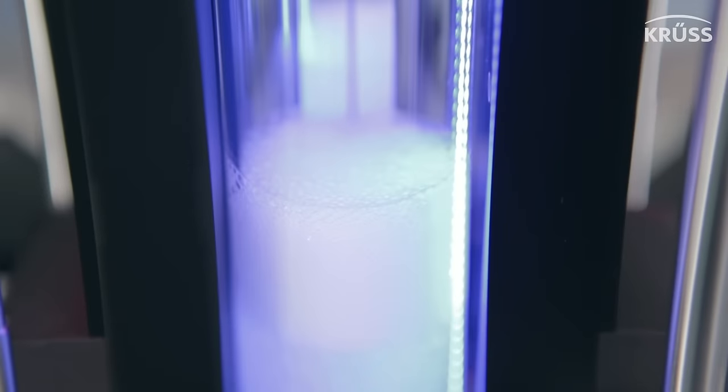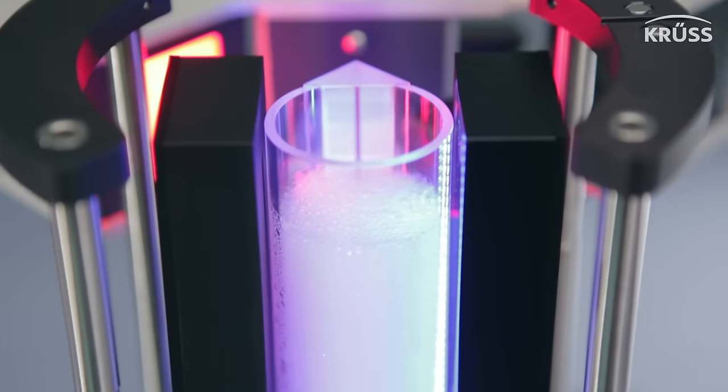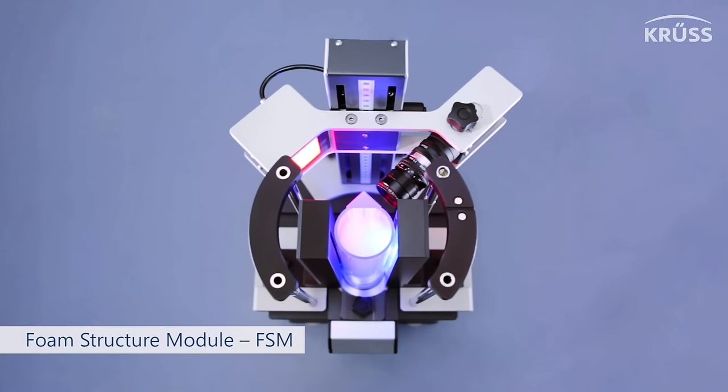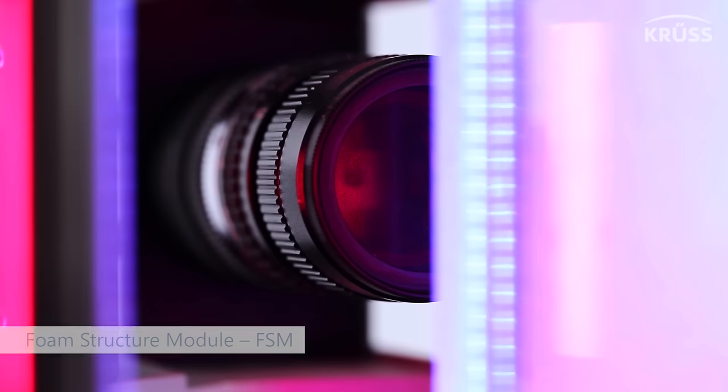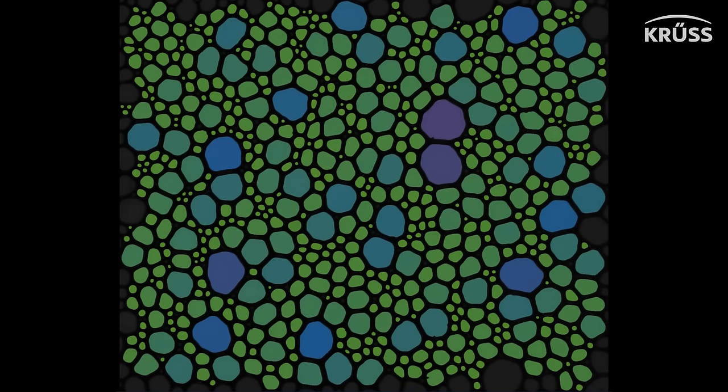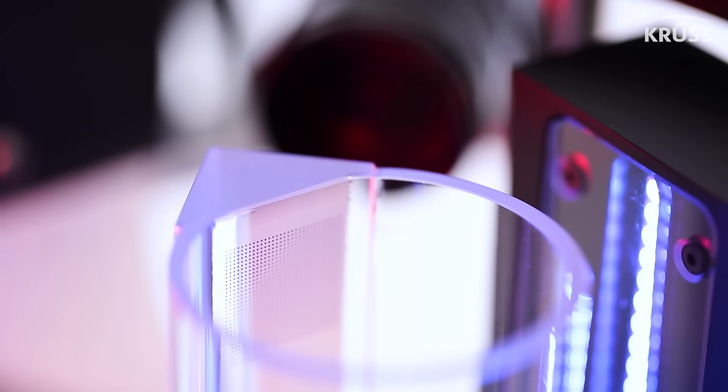But the most innovative part of the instrument is a technique to analyze the actual foam structure itself. The DFA 100's Foam Structure Module, FSM, uses a microscopic camera and special prisms to generate a perfectly sharp live picture, which is analyzed by the software. Paired with our calibration grid, we can measure the bubble size in absolute values, even down to 50 micrometers.